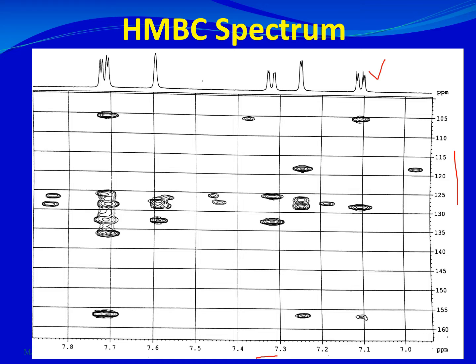The difference between HSQC and HMBC is that HSQC shows one-bond coupling, giving only one contour below a proton peak, whereas HMBC shows long-range couplings so a proton may correlate with more than one carbon atom two to three bonds away. The first proton we examine resonates at about 7.1 ppm. We draw a vertical line down from the center of this peak to find the contours below it.